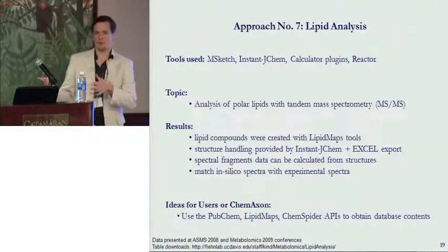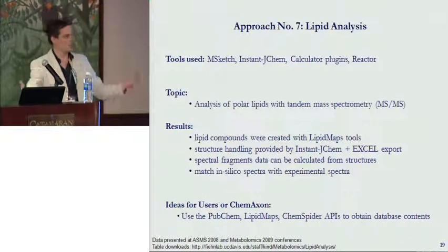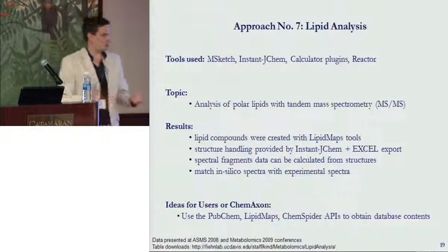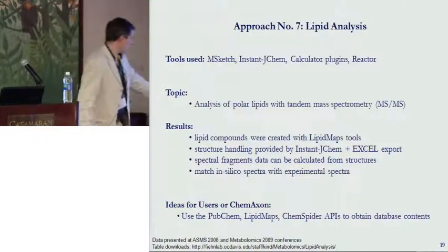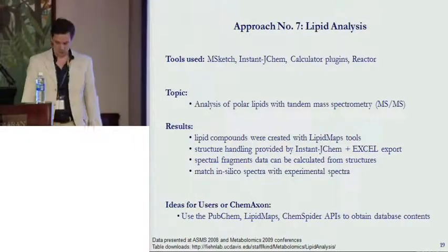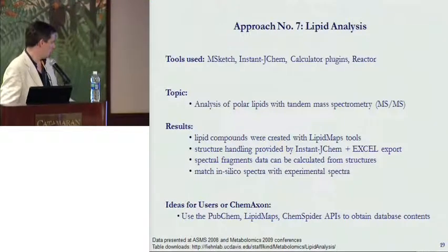If we have an exhaustive set of all lipids, we can create those in-silico spectra and match them against them with a normal library search, a dot product search, and there we go, we have it identified. This data was presented at several conferences, and the manuscript will be submitted soon. You can also download tables from our website.